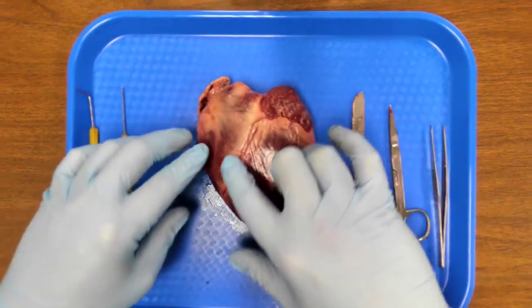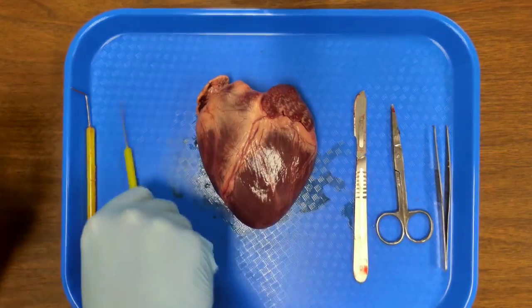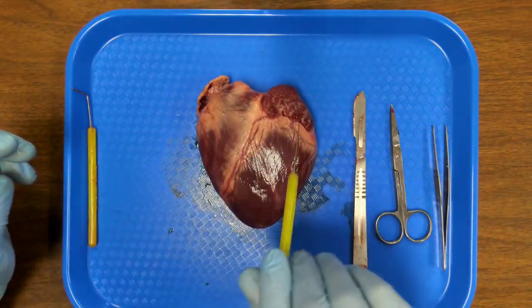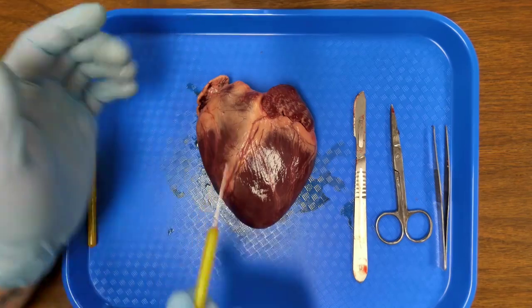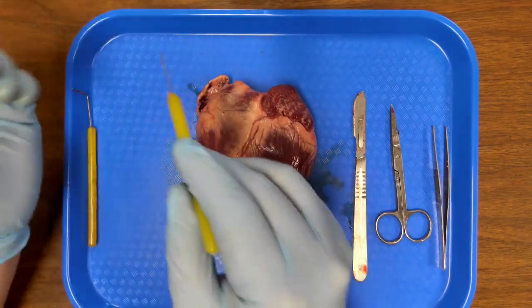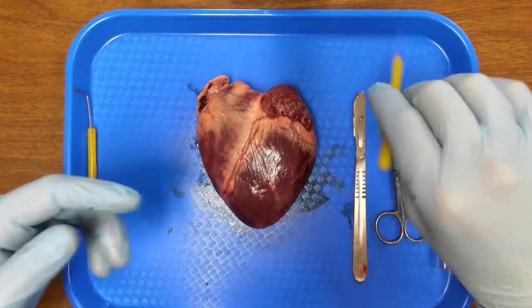This right here, underneath this, we'll find our septum. That is that big, thick muscle that separates the heart in two halves. So you can see that there are clearly two halves on the heart. This is the right side. This is the left side. And notice how much larger the left side is than the right side. That is because this left side has to pump blood to the whole rest of the body, while the right side only has to pump it to the lungs.